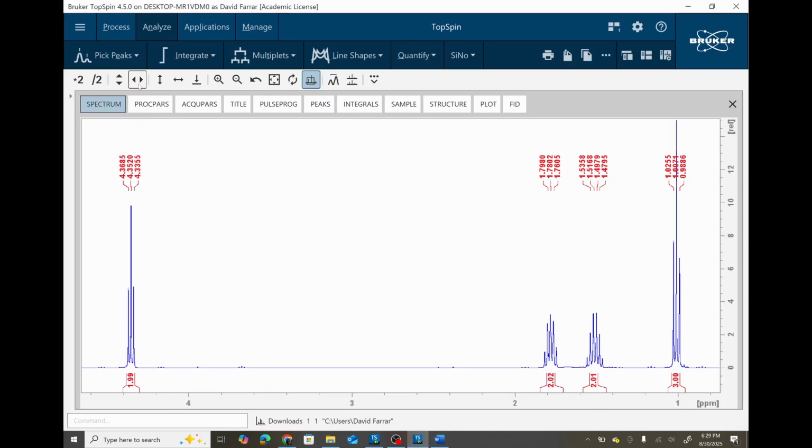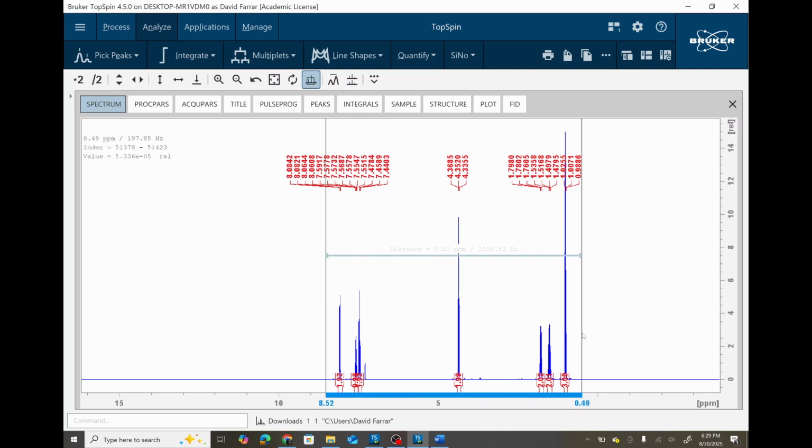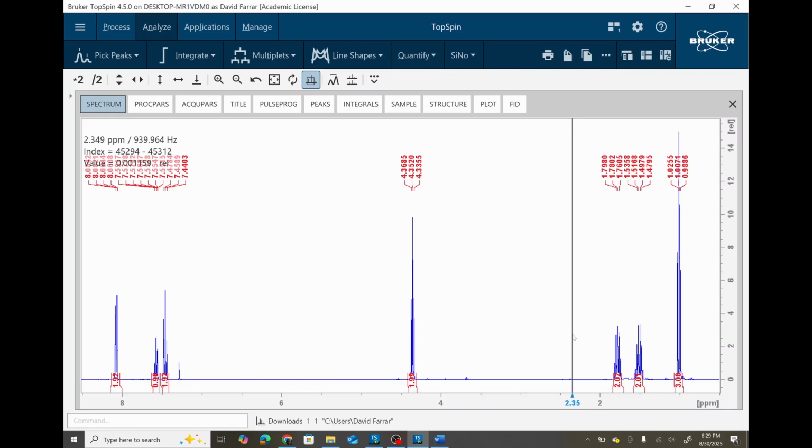Just a quick comment here. If we go to full spectrum, you do see all this dead space, and again, this makes it even harder to read the shifts. So typically we don't want that, and so we do an expansion with the whole spectrum of just that region that actually has peaks, and then the upper and lower shift regions.